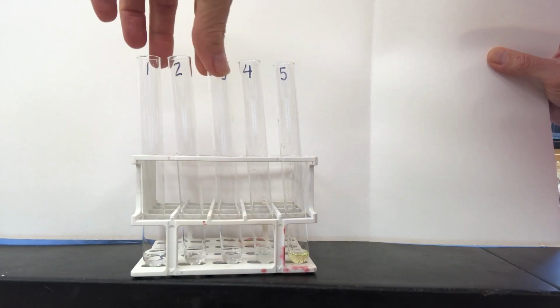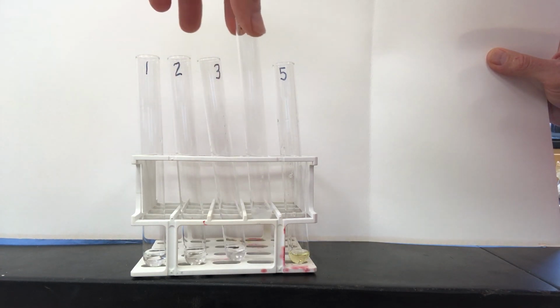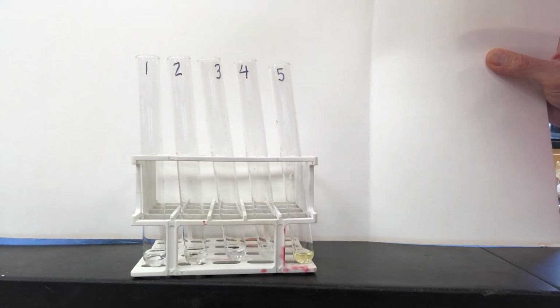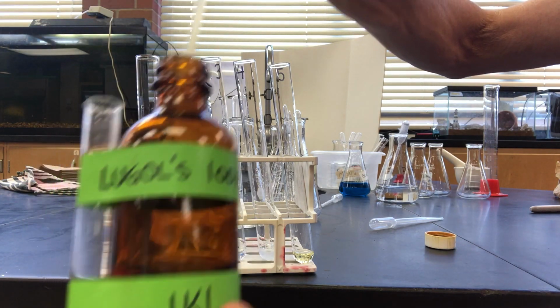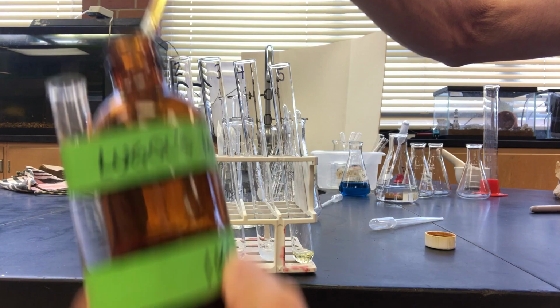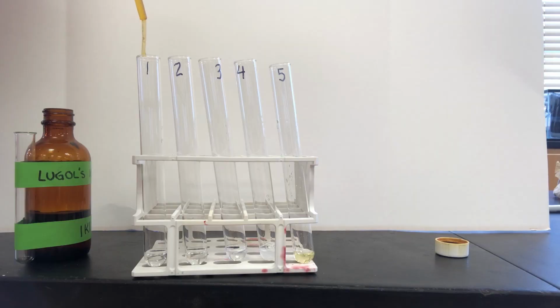Once again, add 1 milliliter of the known macromolecular samples to the appropriately labeled clean tubes. Taking the bottle of Lugol's solution, withdraw a pipette full of the potassium iodide. Add 1 drop of the IKI to each test tube of the known samples. Swirl the test tube to completely mix.